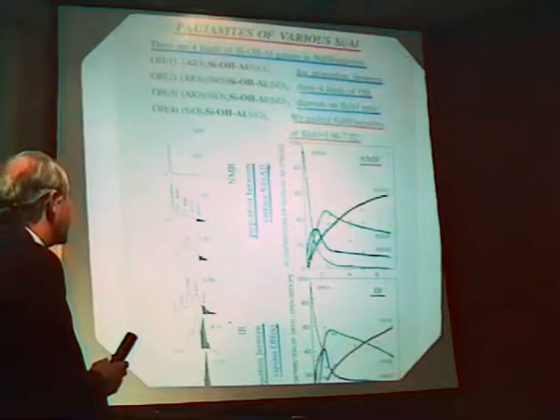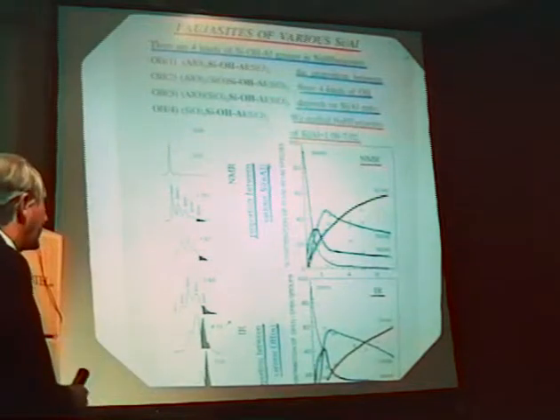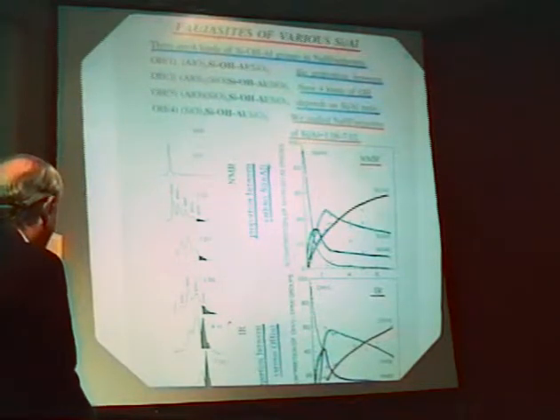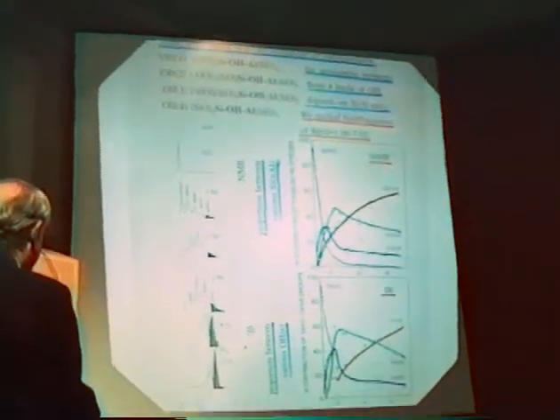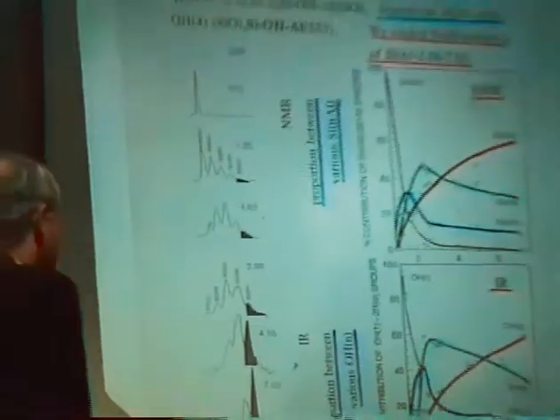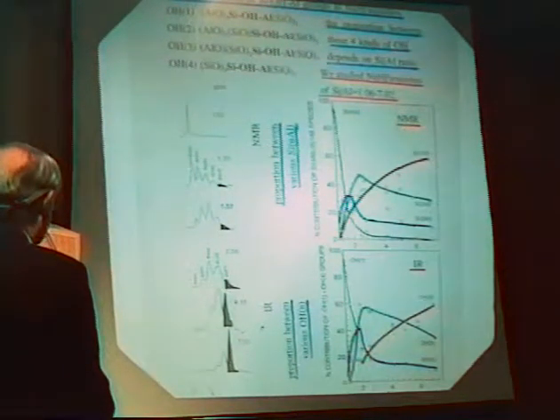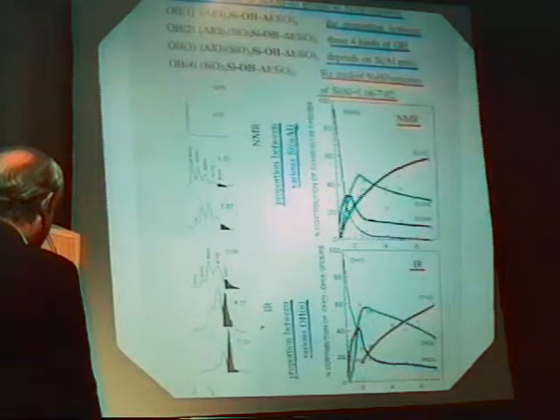We made a parallel NMR study and IR study. NMR spectra were taken in Cambridge University, the IR were taken in our laboratory. Those are 6 of our 15 NMR spectra. We see 5 NMR signals. The signal of Si having 0 Al, this one which cannot create bridging hydroxyl, is marked in black. We see that the proportion between those signals depends strongly on Si to Al ratio.